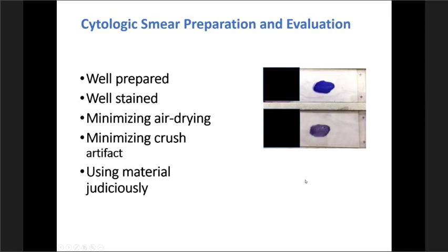Basically, these should be well prepared in time, and if you are physically there with either yourself or your cytotechnologist, the material can be judiciously used for on-site preparation. So your next question would be, what happens to the residue in real time? We are really moving very fast between one pass to the next pass of the FNA procedure. So this is what happens.